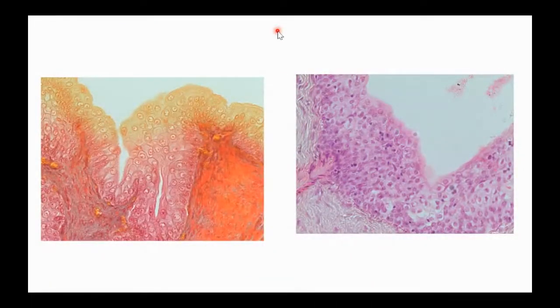Who knows from the guided lesson what we're looking at right here? Does anyone know what we're looking at on these ones? Yeah, Kira's chiming in. She's correct. We are looking at Dr. Allis's least favorite kind of tissue to look at, or maybe one of my more least favorites in general. These are kind of the two main appearances of our tissues that have transitional epithelium on them.